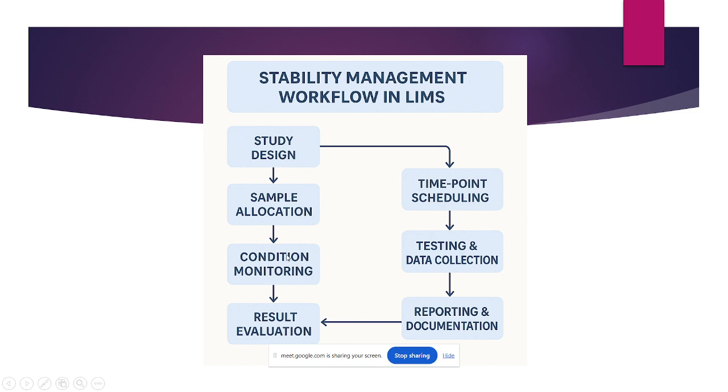Once the sample allocation and the conditions are done, testing will automatically be performed. Once the testing is performed, reporting in documents and result evaluation will happen. Okay, like this also we can do, or either we can do it like this also.